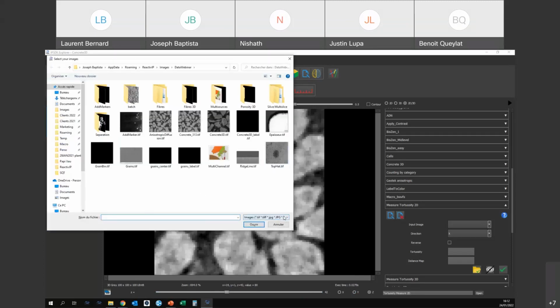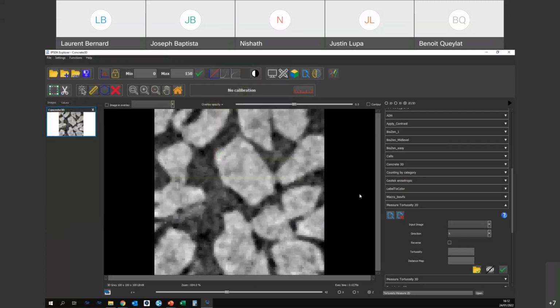Other point that we can do now for those who are dealing with Zeiss devices, now we can directly integrate and import CZI files. So the Zeiss format, we can also deal with multi-JPEG files, so new readers that can save us a lot of time when importing data.